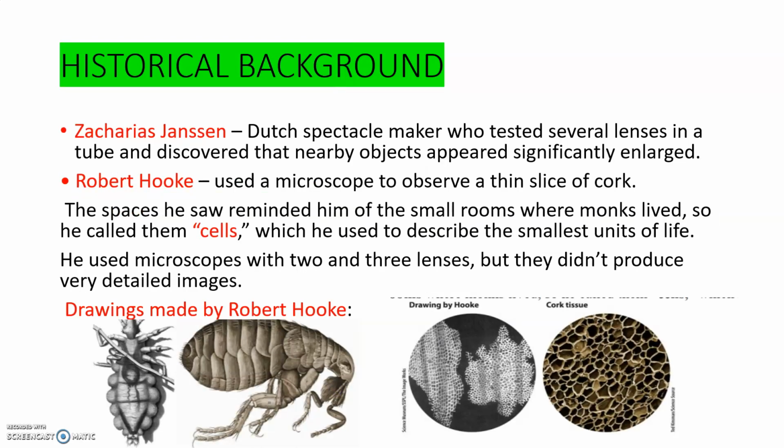Historical background. Zacharias Janssen: in 1590, Hans Janssen and his son Zacharias Janssen both developed the first microscope.